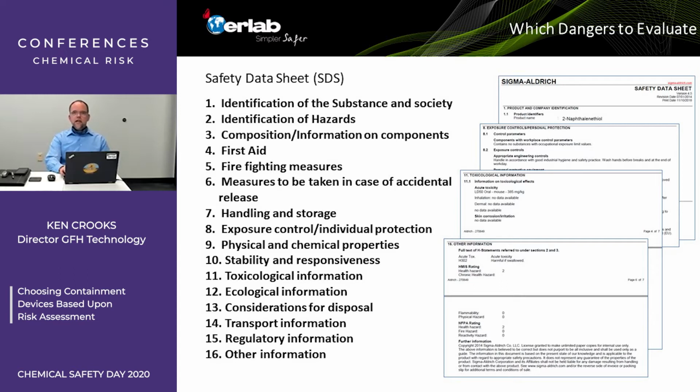to understand the hazard. I just chose one very quickly, and it was 7 pages long, and I know there are some that are even longer than that, but all of this is very important to evaluating and understanding the danger or the hazard that that chemical presents. And you have to do this, of course, for every chemical.